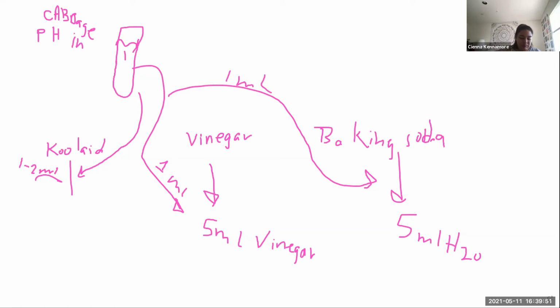Because last time you used 10 mils, right? Yes. So we're just going to dilute it by half, and I'll adjust it on the lab report. So I do the same steps. I added 2 drops of soap and 1/4. Yep. But what you're going to do is put 5 mils of water in so that it's 5 mils and 5 mils, a total of 10 mils.